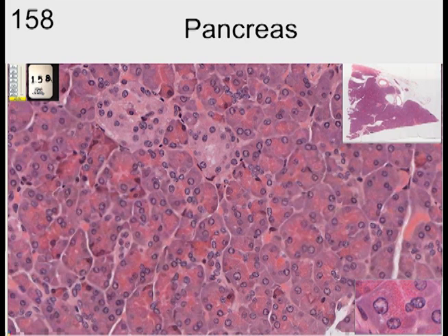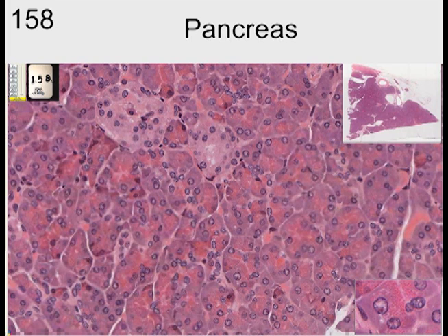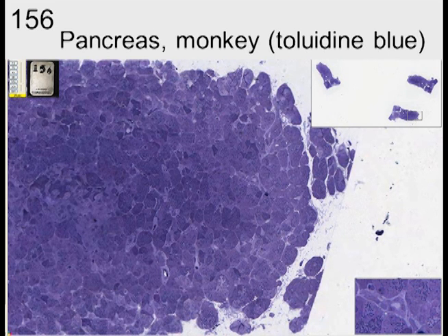In this particular slide 158, you can see the base of the cells — the cytoplasm is blue. But as you go to the lumen of the cell, which you can hardly see in the pancreas, you see red granules. These red granules are secretory granules that are going to be secreted into the lumen, because this is part of the exocrine gland — namely, that secretions are secreted in a duct, as opposed to an endocrine gland where they're secreted into the blood system.